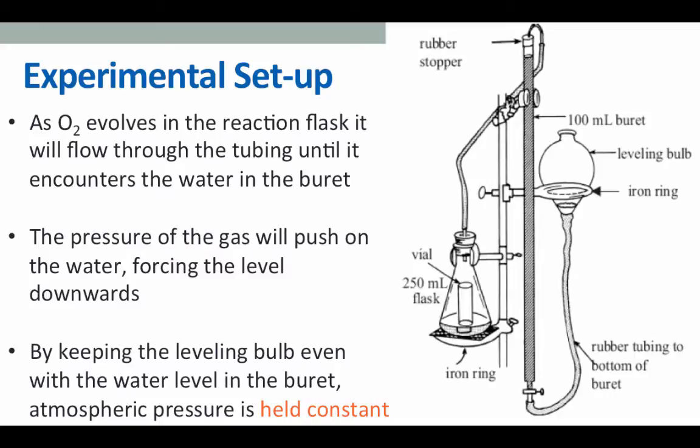This is going to be important in order to use the ideal gas law to calculate the moles of gas and also to help prevent any leaks in the system. The reaction that you are conducting today is really quite rapid, so it's good to spend a lot of time before you start the experiment making sure that your apparatus is gas tight and that you and your lab partner are communicating well with each other about coordinating shaking the Erlenmeyer flask and moving the leveling bulb.